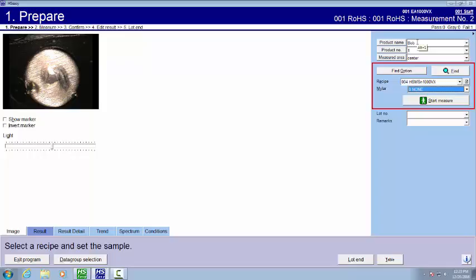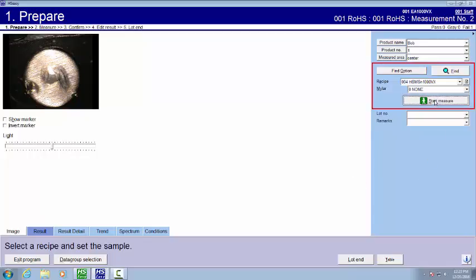You can also up here, as you can see, enter the product name, product number, and measured area. I have center here. Of course, I'm measuring in the center. And I'm going to push start.